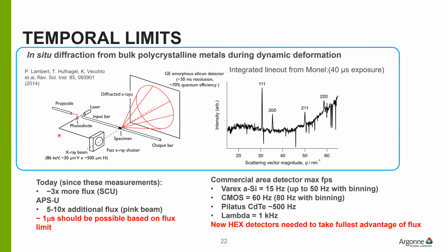One comment about the temporal limit. The APS 1ID Hutch program has done some high dynamic work, like I've indicated before, with the AM chamber, or some of the work that Todd Hofnagel's group did in the past with the dynamic loading, and they were able to measure reasonable peak signals with about 40 microsecond exposure time.